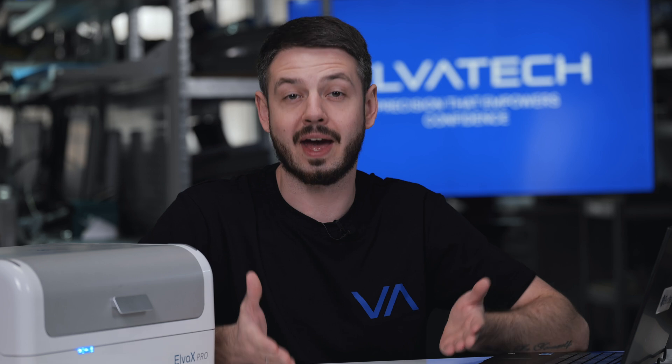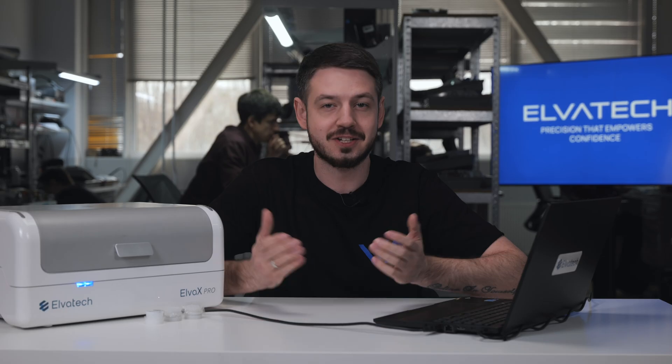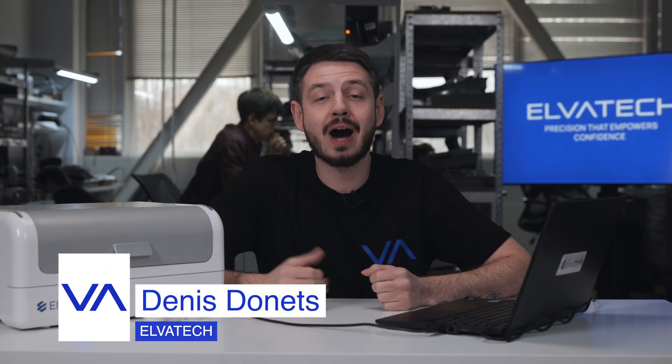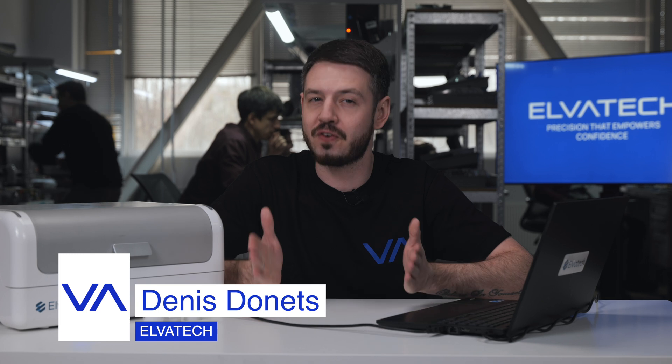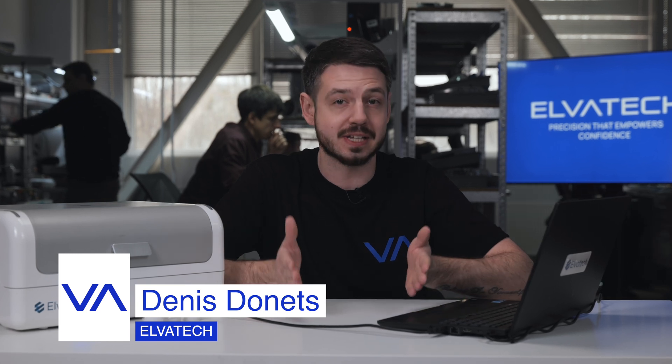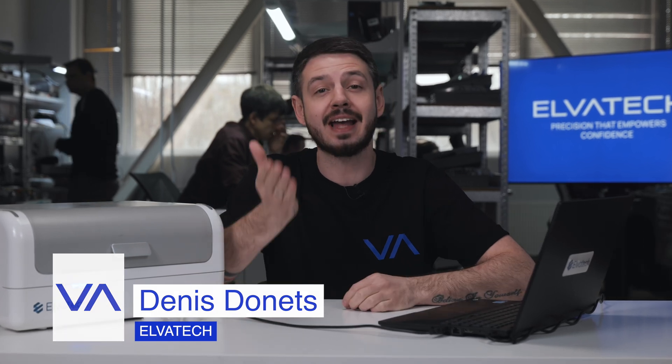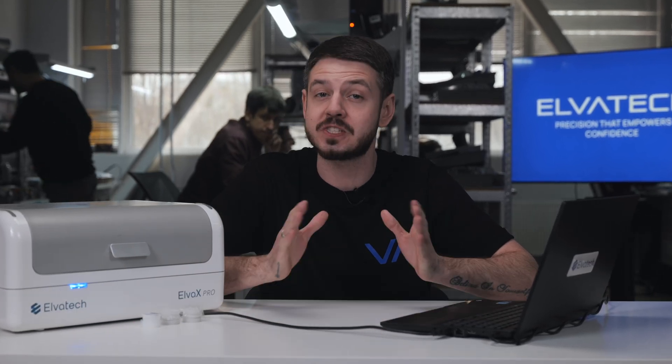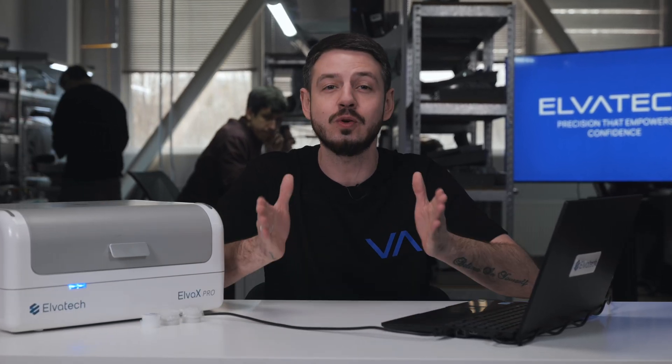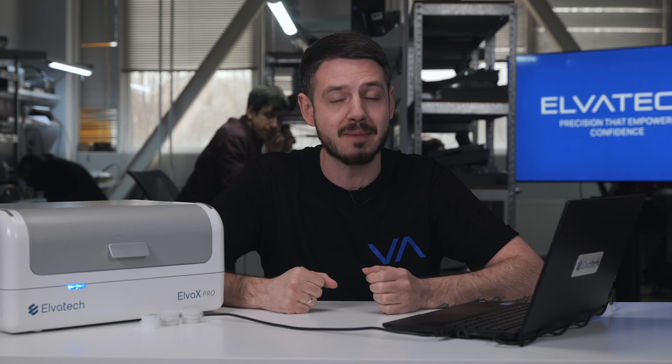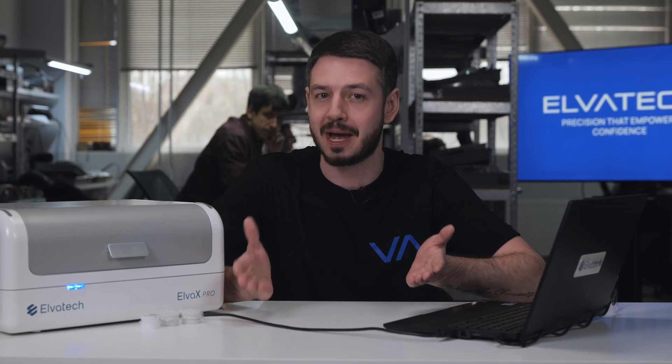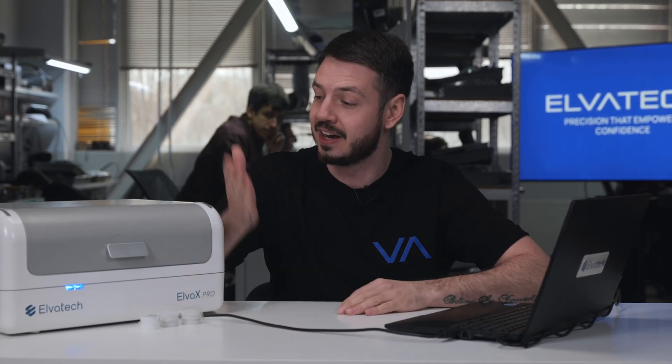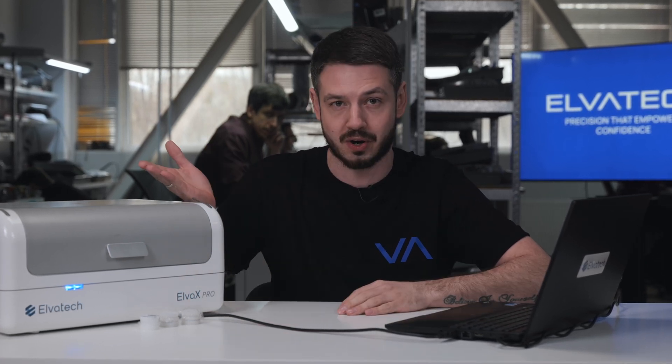Hello and welcome to Elvatech's YouTube channel. Today, we will show you how to perform fast, precise, and non-destructive analysis of cement using our high-performance laboratory XRF analyzer ElvaX Pro.